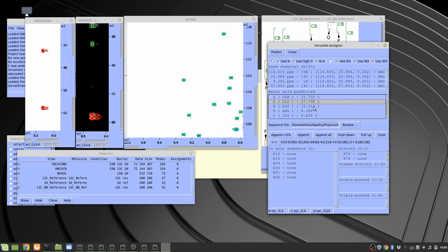If you click the next one, you see the other one. Actually, this one is eliminated. Histidine is eliminated, and for arginine there are no possible ones. We can also set the direction, so we predicted i-1 first and then the next one.